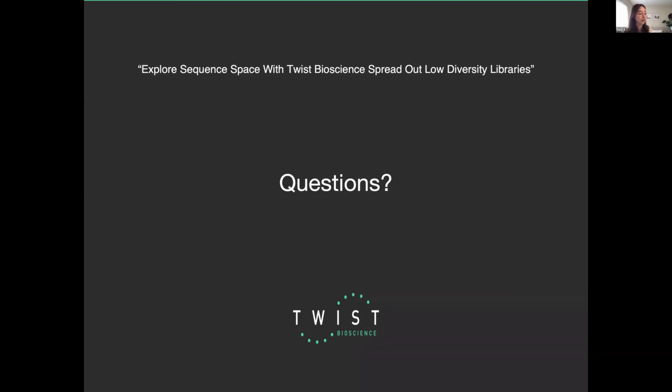Especially if you're using trimers and degenerate oligos, you need to avoid certain combinations of amino acids with each other to avoid those motifs.